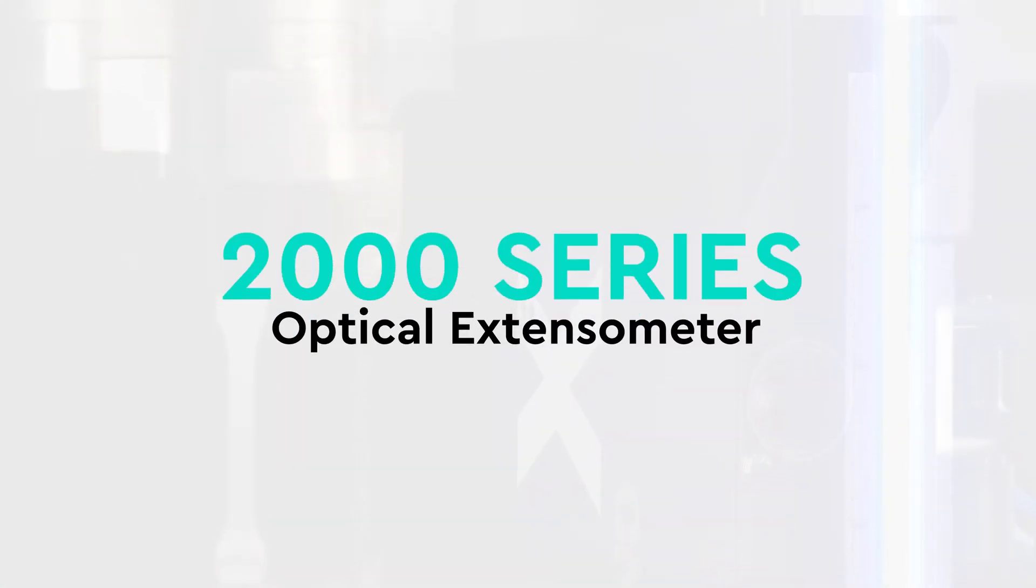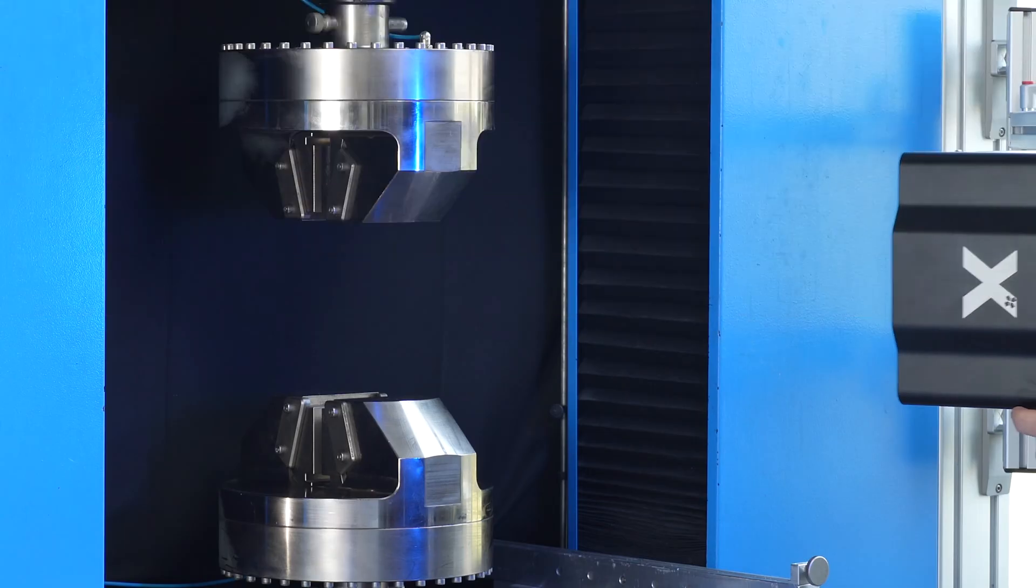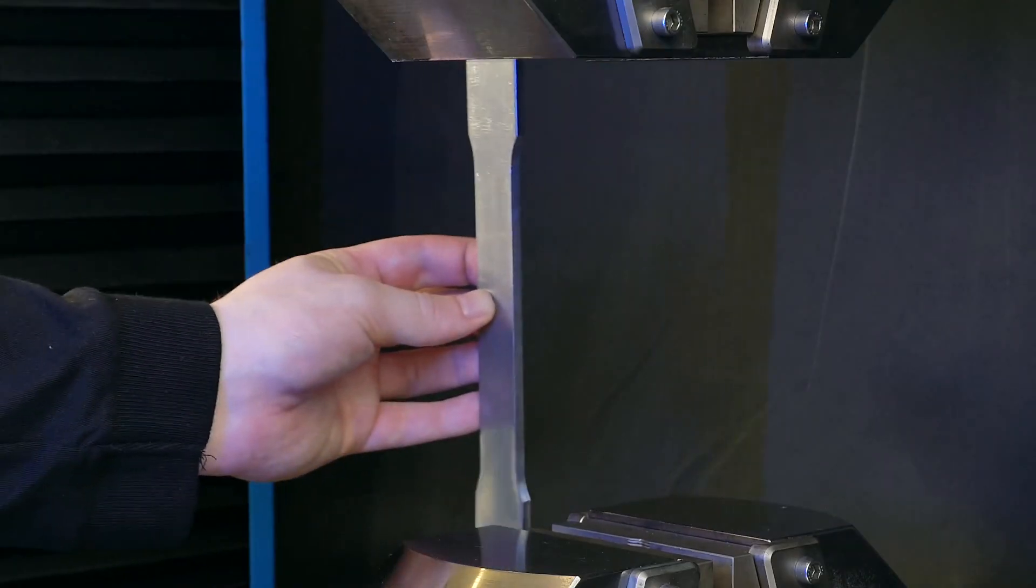We are introducing the 2000 series, a revolutionary video extensometer designed to transform your testing experience.